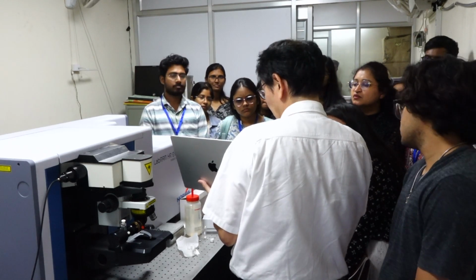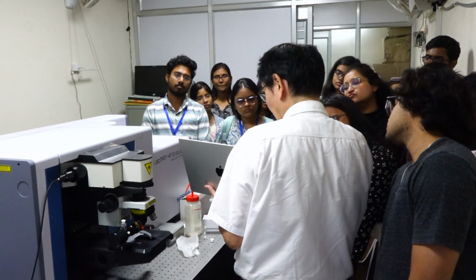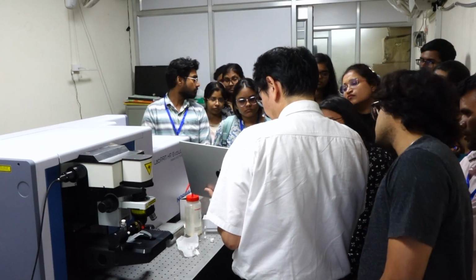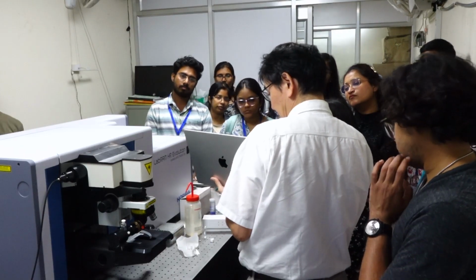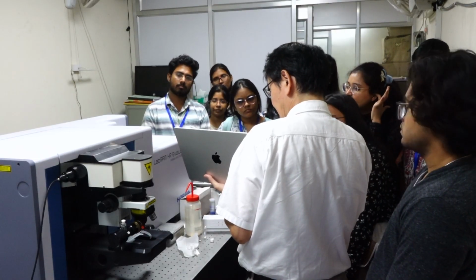So we can compare the IR and Raman spectra, and they give us different information. It depends on the purpose. If possible, please measure both and consider the peak assignment.